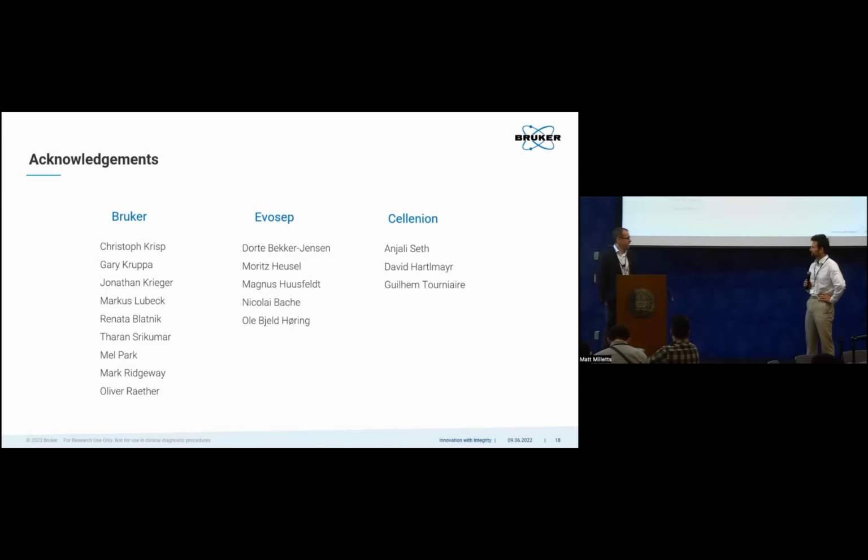It'll also probably create sharper peaks, which will improve sensitivity. And taking more slices, as you're referring to, absolutely would be a benefit. Isolating smaller packets of ions means the software has much less work to do in trying to deconvolute, so I think all these things will particularly benefit the approach.